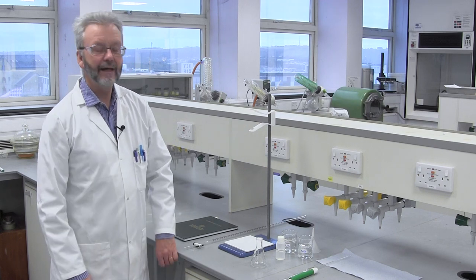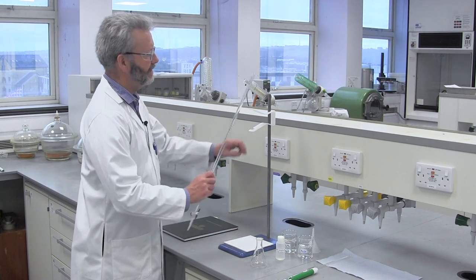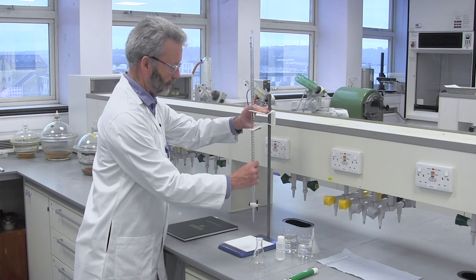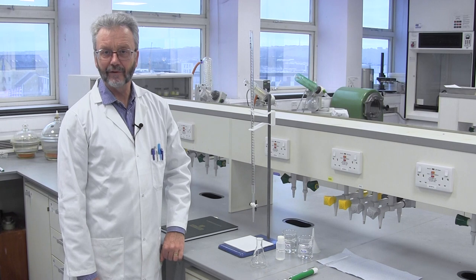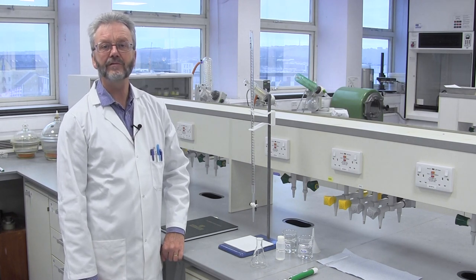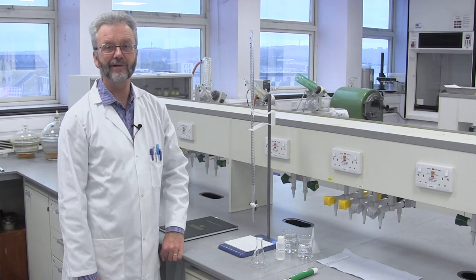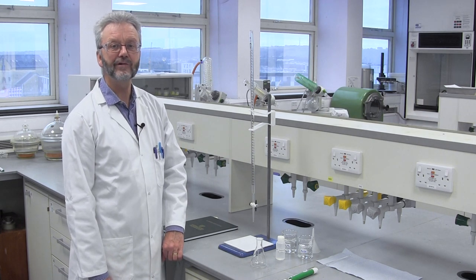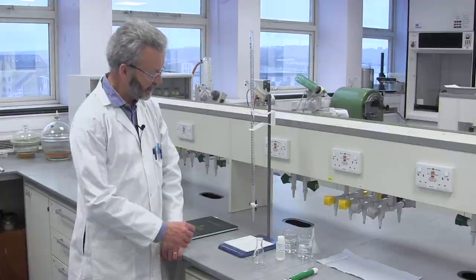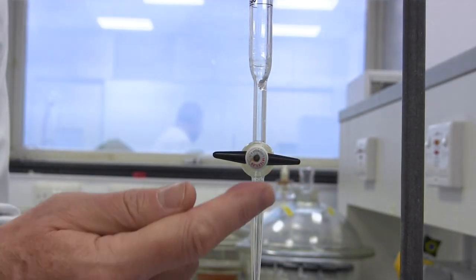Here we are in one of the chemistry teaching labs at the University of Plymouth, with all the equipment we need for the experiment. The first thing to do is to put the burette in the clamp so that we don't have to hold it. Now to fill the burette — the first thing to do is to make sure the tap is in the off position. We can tell this because the hole that allows the solution through the tap runs in the same direction as the bar that is the handle.